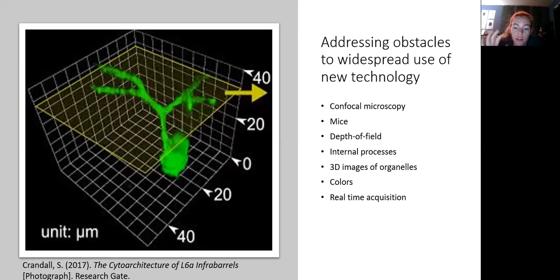And then the confocal microscope pinpointed from those signals where they were able to find specific dimensions, and that's what helped create the 3D portion of it, versus just a conventional everyday use microscope, like we all use. There is a secondary fluorescence that's emitted, and so it blurs out, and they can't get the exact cell and part itself isolated 100%.